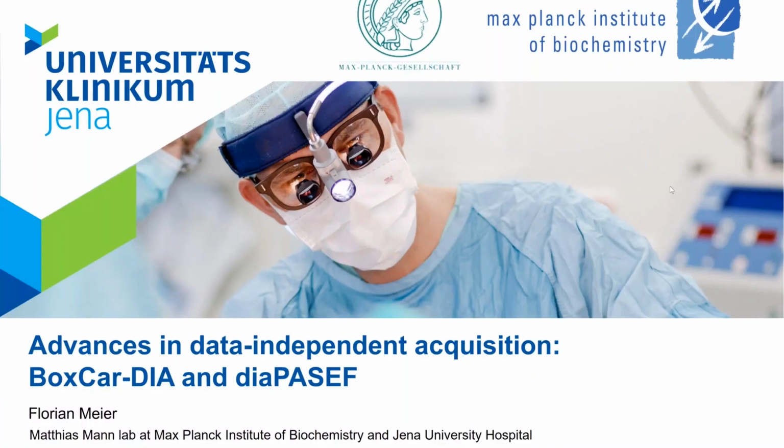Thanks, Tejas, for the very nice introduction. It's really been a great pleasure to work with you for the last years, and it's very nice to have this opportunity now to talk about some of these projects. There's going to be a tour through several of these projects, but the overarching theme of the talk is how we can handle ions efficiently as we shuffle them into our mass specs.